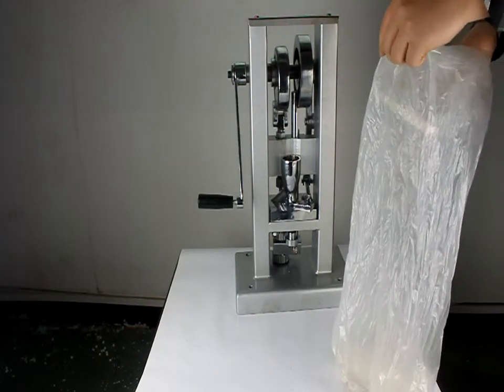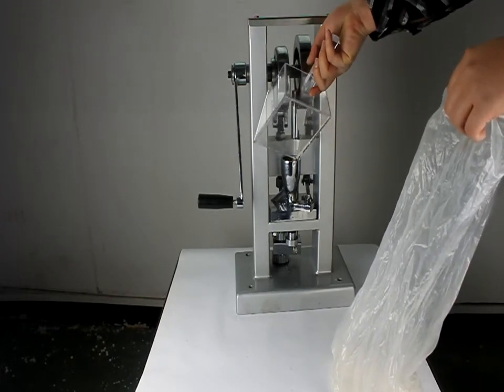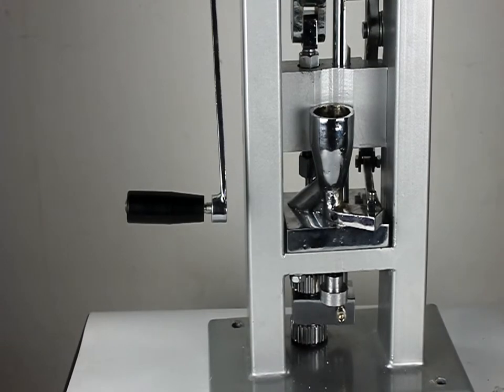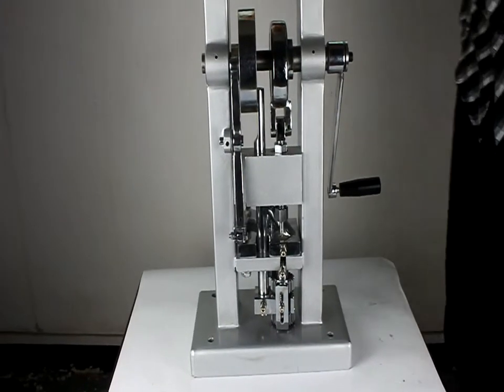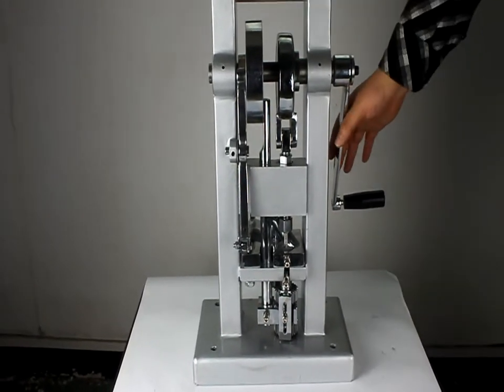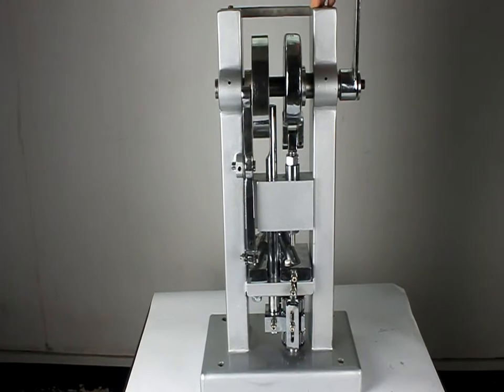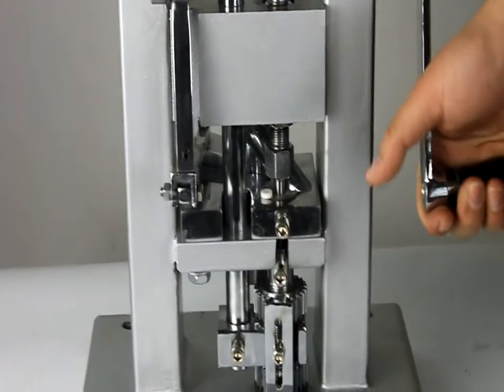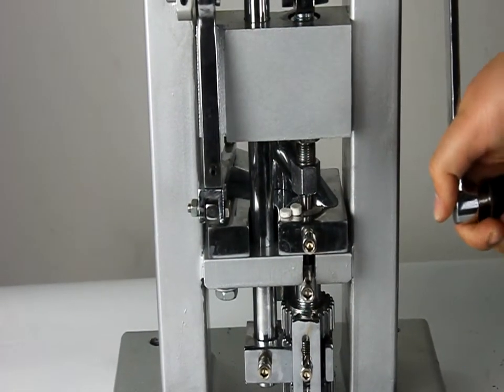Now let's take out the powder and put it into the powder holder. You can see the tablets coming out one by one.